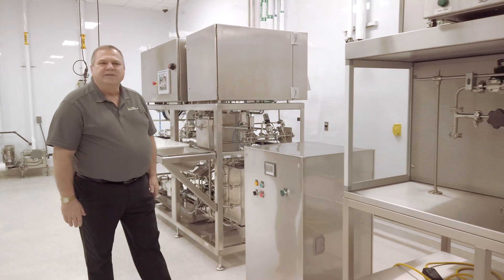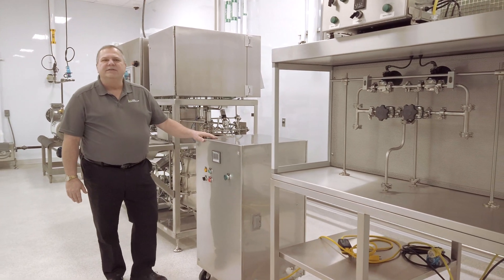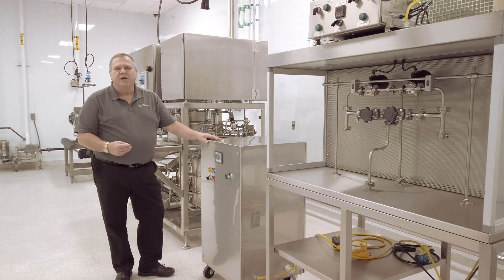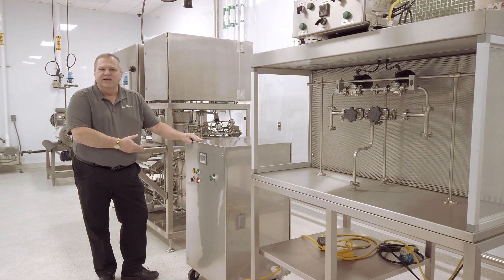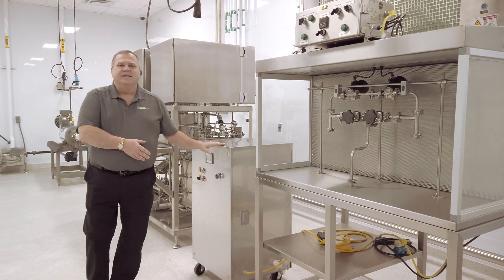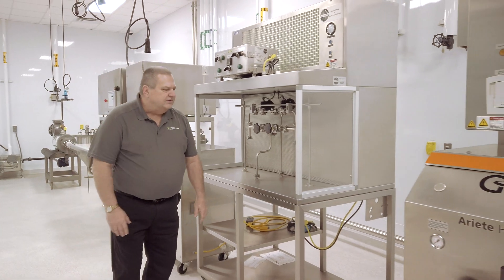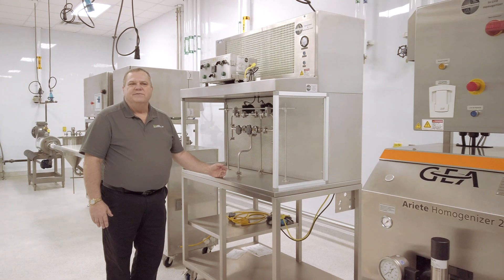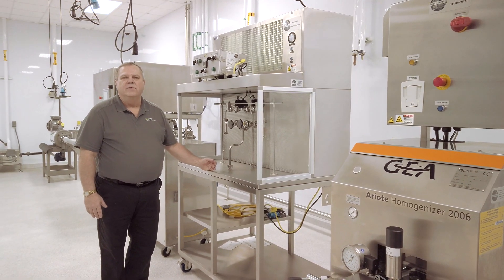The fruit juice industry over the past few years has had to look for different ways to pasteurize and sterilize their products yet retain that beautiful color and flavor we're all used to. One method being utilized is ultraviolet light pasteurization, and this particular cabinet can do that. When we're ready to fill our products into packaging, one of the things we have is a bottle filler that allows us to fill one-ounce to two-gallon plastic or aluminum bottles.